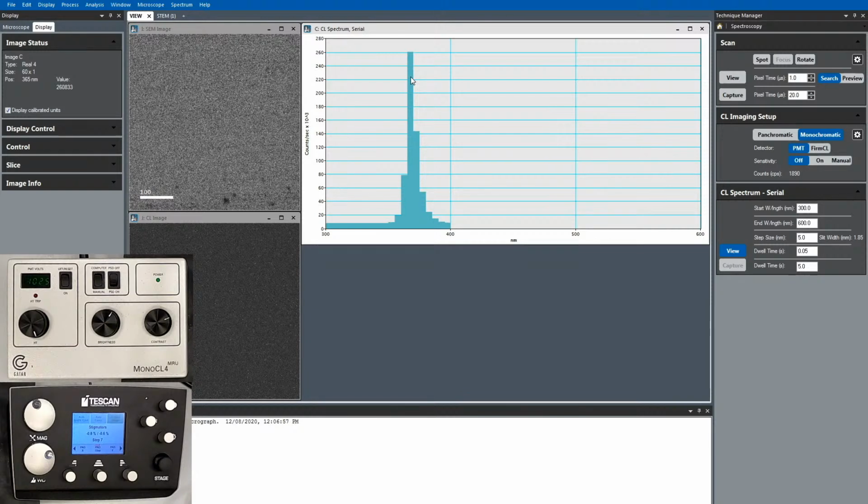So you obviously don't need to go through this full range, 300 to 600. As you plan your experiments, our full range that we can measure is 180 nanometer in the ultraviolet up to 2400 nanometer in the IR. There's a little gap around 900, I think like 850 to 900 that we just can't measure. We have to use 2 different photomultipliers.